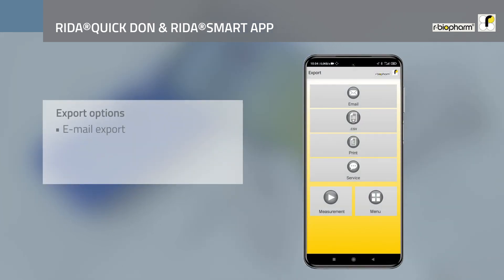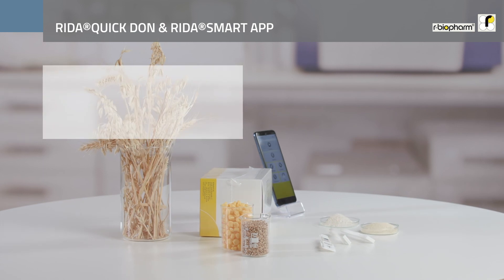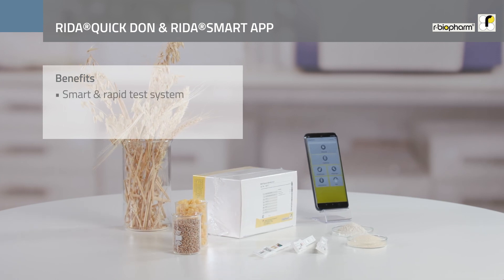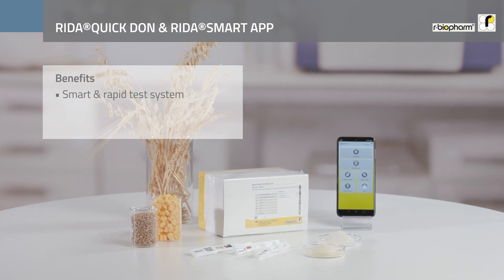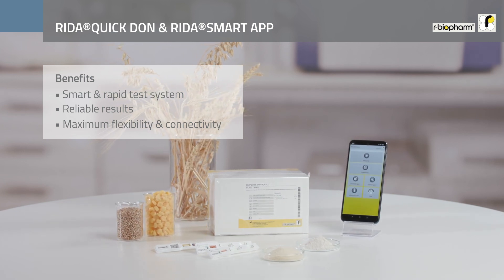Easily send your results to an email address or to a printer via Bluetooth. Enjoy full connectivity via Wi-Fi to export your results into a cloud. The RIDA QuickDON RQS-ECHO and the RIDA Smart App in combination is the smart and rapid way to quantify your lateral flow test strips, offering a simple and convenient solution to collect reliable results independently of location.